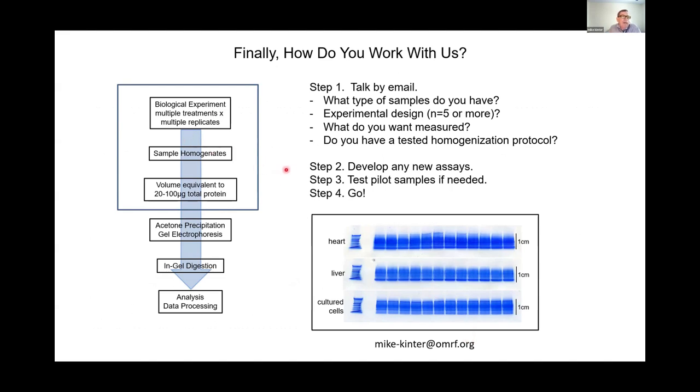Ultimately, we like to get homogenates from y'all. Usually we ask that you do a protein assay and send us a particular amount. A lot of times, quite frankly, we go ahead and repeat that assay. And it was mentioned yesterday, that's really a very inefficient part of our sample handling. It uses a fairly good amount of the homogenate.